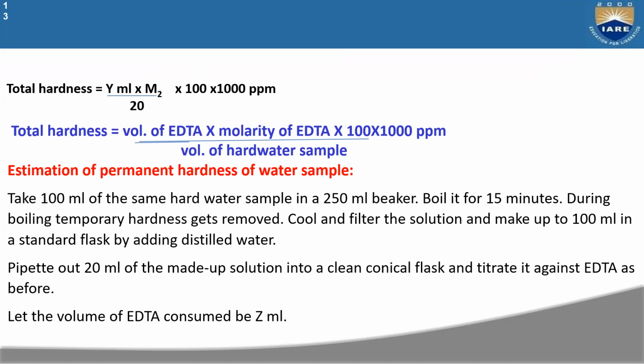The second step contains the same EDTA solution, and in the conical flask only the given hard water, which we titrate with the EDTA solution.